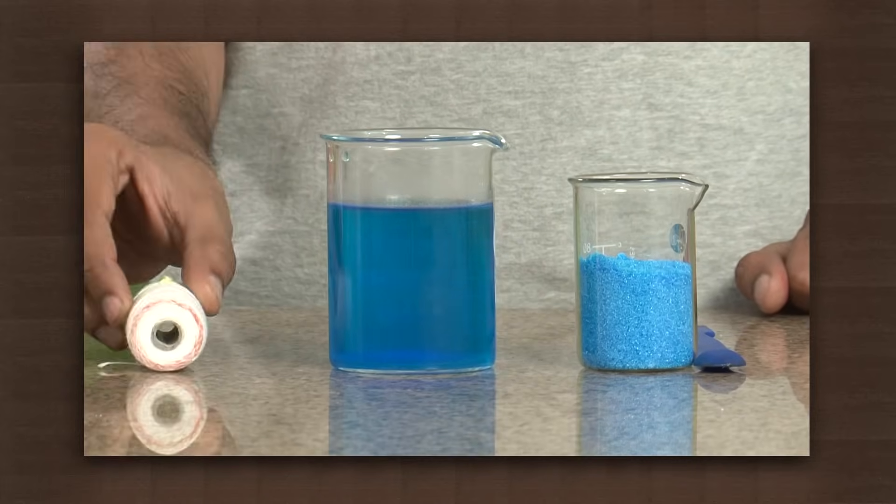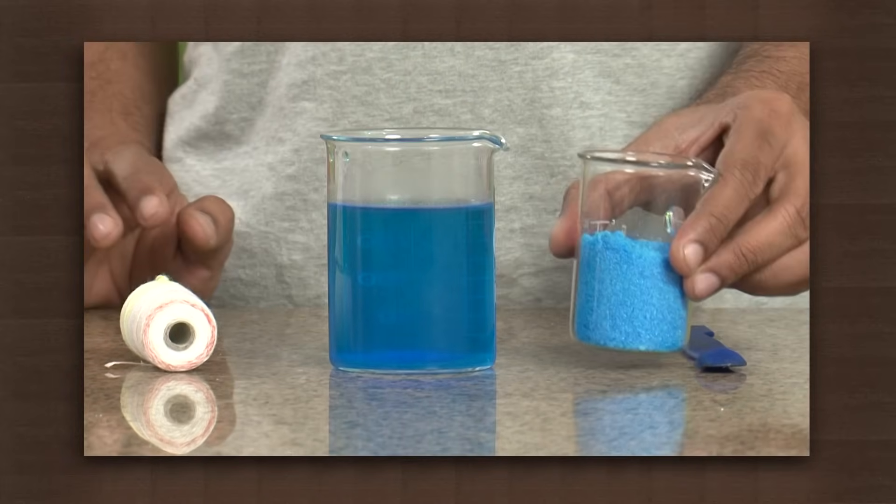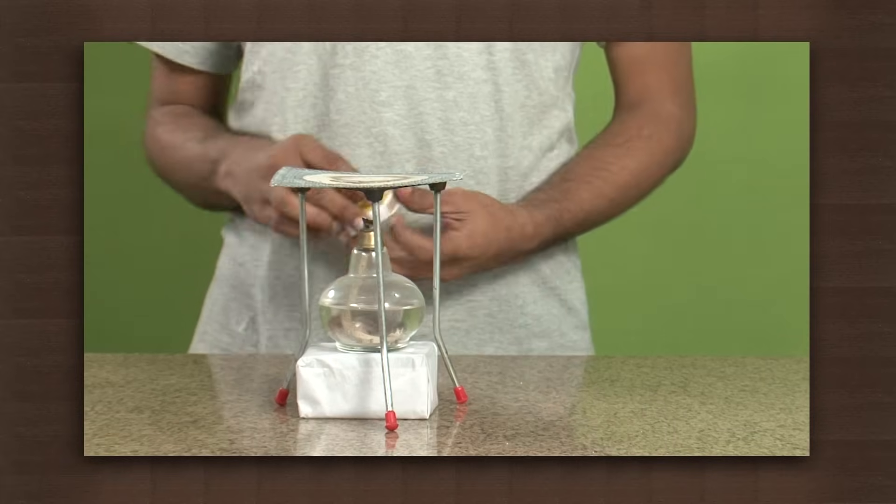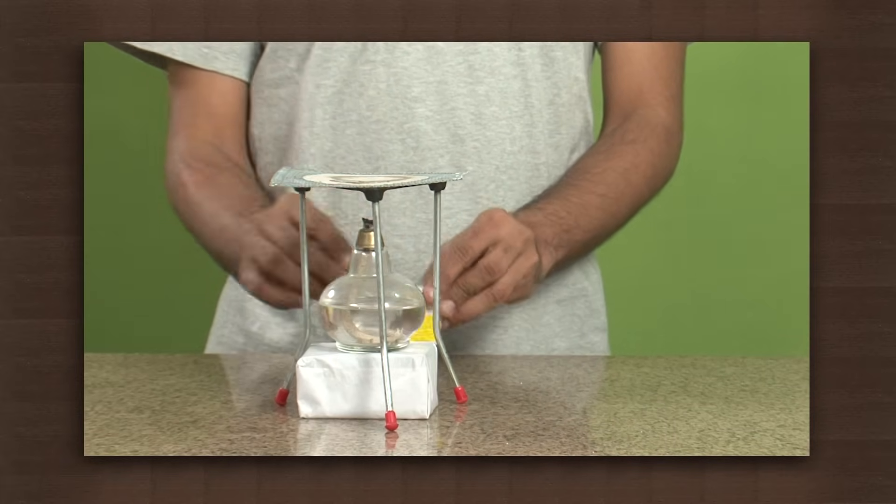For this we need thread, a saturated solution of copper sulphate and copper sulphate. First, we will make a super saturated solution of copper sulphate.